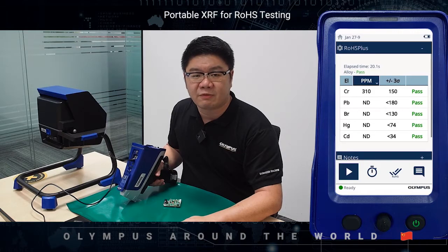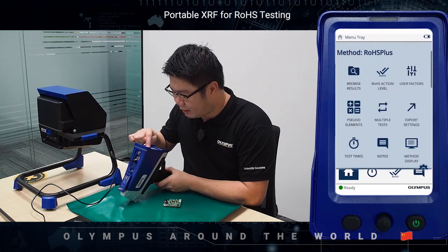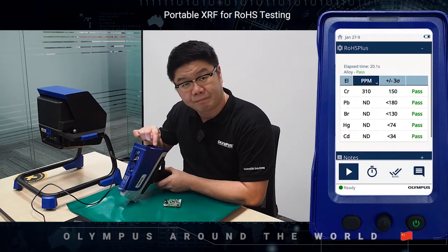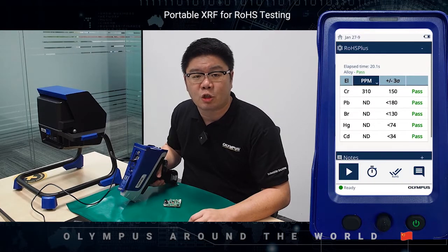Let me now show you how to operate the Vanta. The user interface of the Vanta is simple like a smartphone. All you need to do is swipe, flick and tap, and anyone will be able to master the operation in a short time.